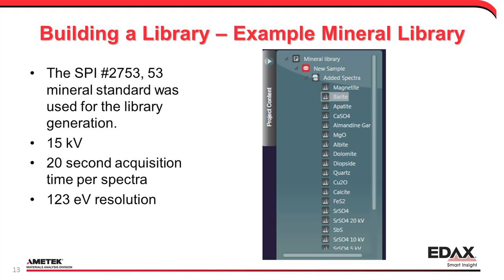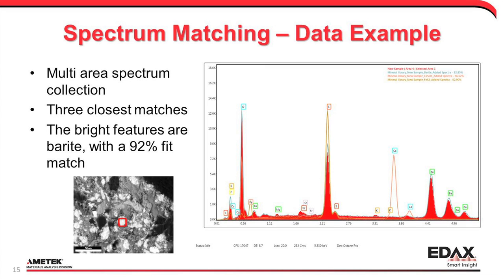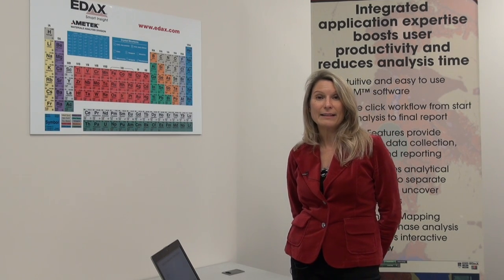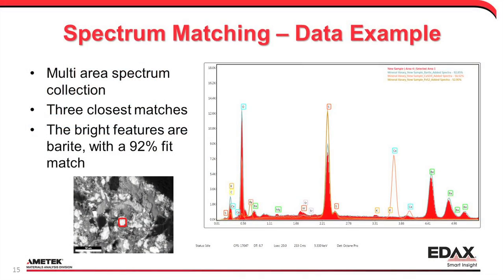In the example shown here, we built a library based on a mineral standard — specifically a common SPI mineral standard under typical microscope conditions on an EDX system. Each spectrum was collected for only 20 seconds. We then analyzed an automotive brake pad as our composite sample, taking spectra from different areas. The bright feature was selected as our analysis location, and after gathering the spectrum and clicking the match button, the match tells us that spectrum from that bright area matches the mineral barite with a 92% fit value.